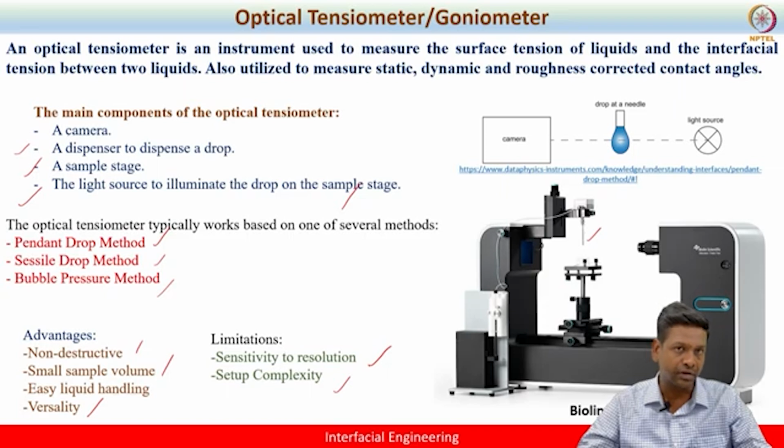based on interfacial rheology. Which means that one can find out what is the G prime, G double prime, okay, of the colloidal particles adsorbed at the interface, right? So interfacial rheology can be performed using this module. So some of the latest techniques available today provide these facilities, okay, right?